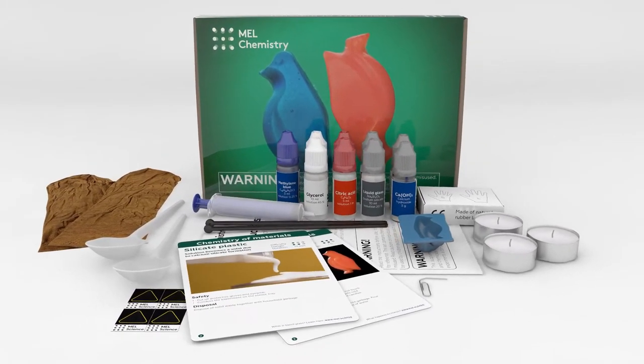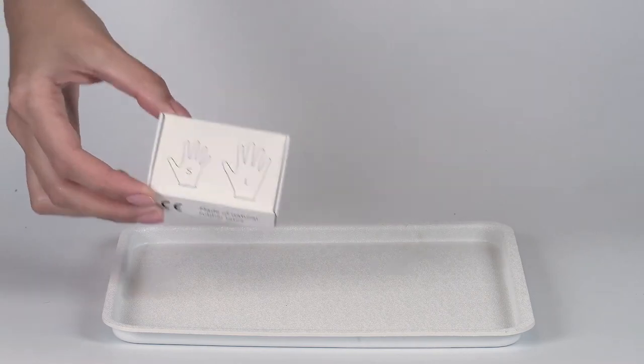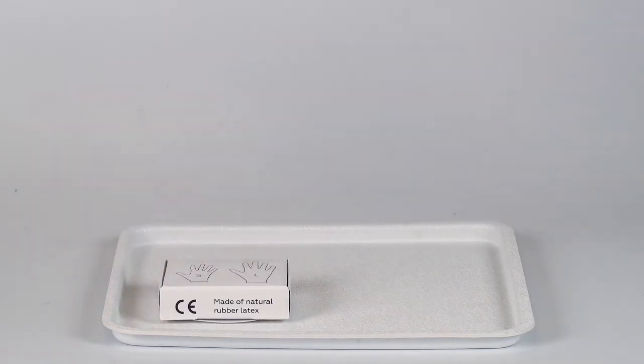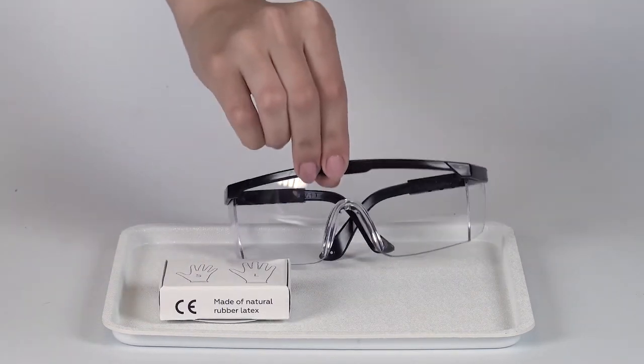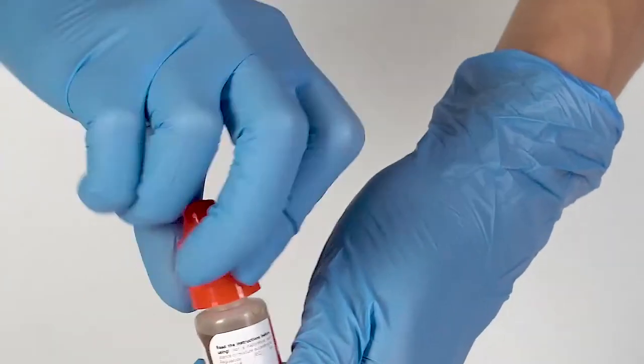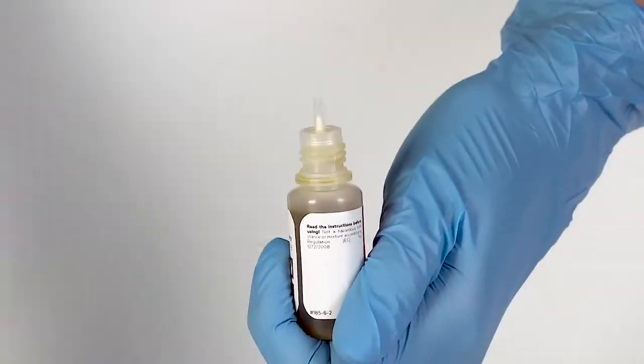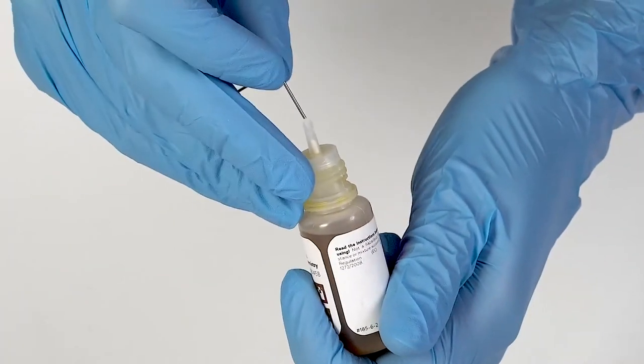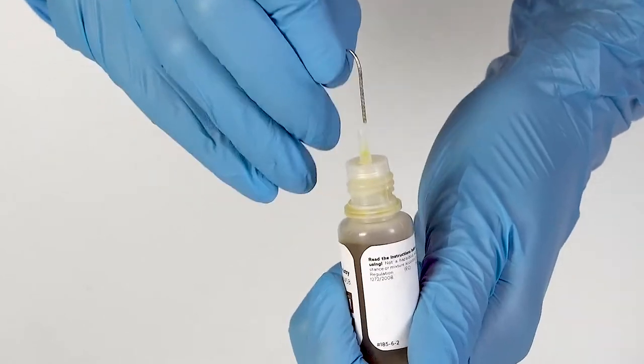Perform this experiment on a plastic tray to contain any possible spills. Don't forget to put on protective gloves and goggles before doing the experiment. To open a bottle containing a reagent, push the cap down and turn it. Pierce the bottle nozzle with an unbent paper clip.